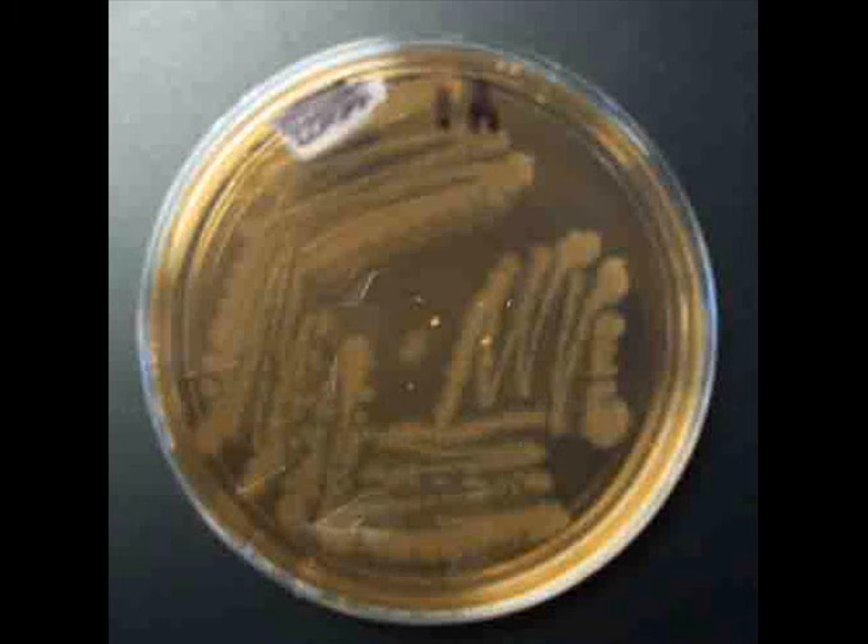You can see, in contrast to the previous picture where we had Gram-negative lactose fermenters growing and the plate looked bright pink, this plate has Gram-negative non-lactose fermenters, which are growing in colorless colonies. You can see that the medium itself is kind of this dingy color now.